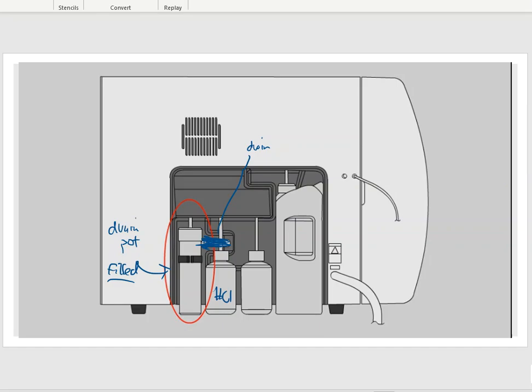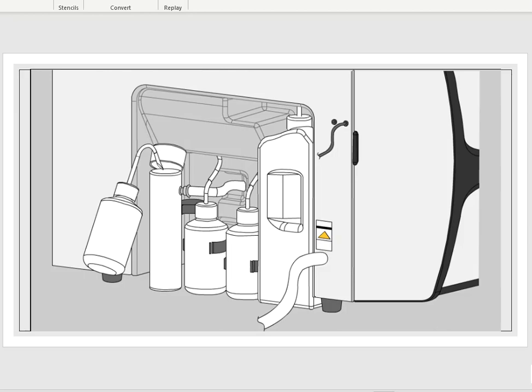So I'm going to go get a DI water bottle again, and I'm going to bring it over. And probably when I check the dehumidifier level, I want to ensure that that water level is up to the sidearm piece, so therefore it can drain. If not, then it's pretty easy to do. The only thing that you have to do is pop open that rubbery type of lid that's seated on it, and you'll just take a DI water bottle or a beaker or something that's filled with DI or distilled water, and you just fill it all the way up to the top.